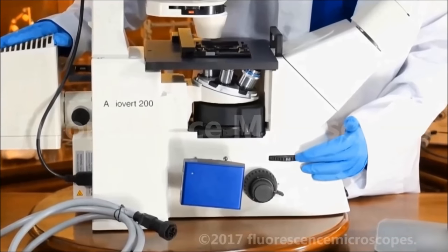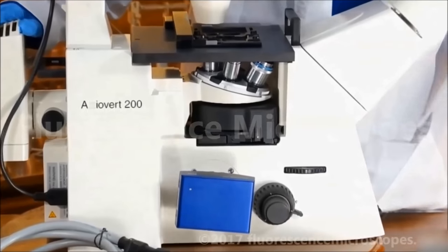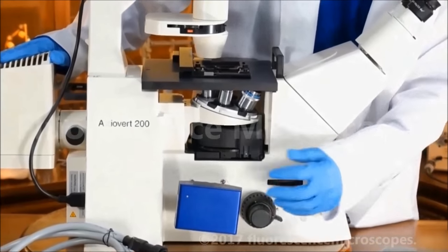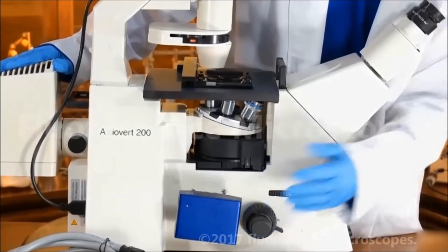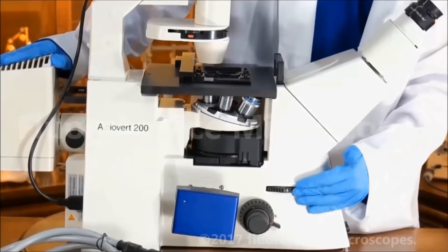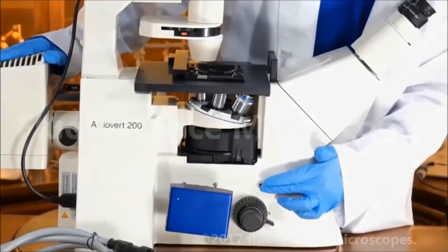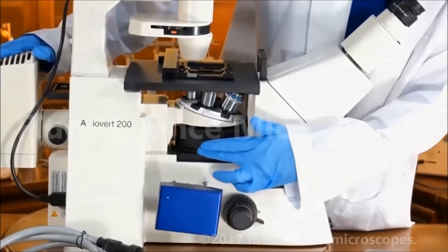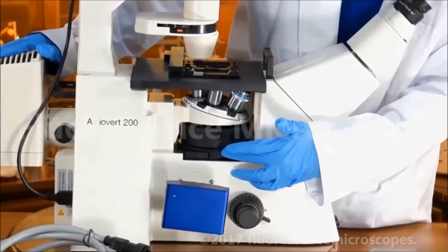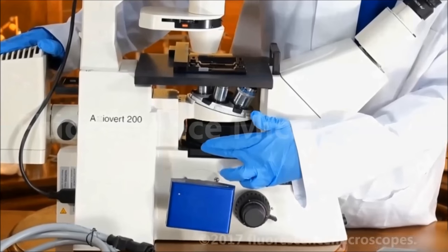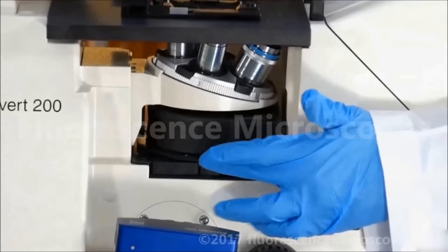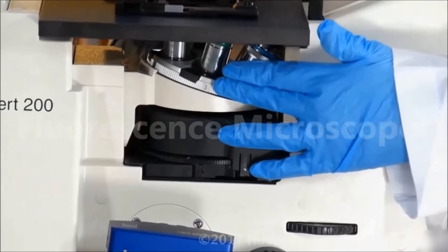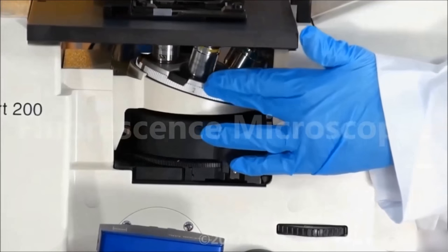This is a dial that changes the light to go from 100% eyepieces to 80% camera, 20% eyepieces. This dial changes the reflector module that's inside containing your dichroic filter cubes. And you manually rotate these objectives.